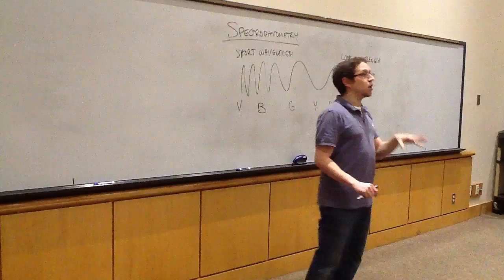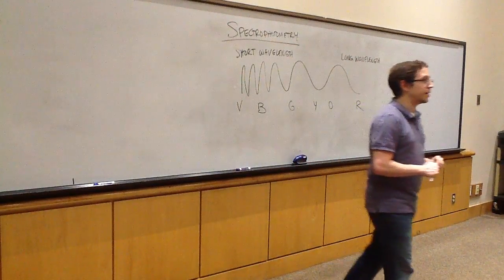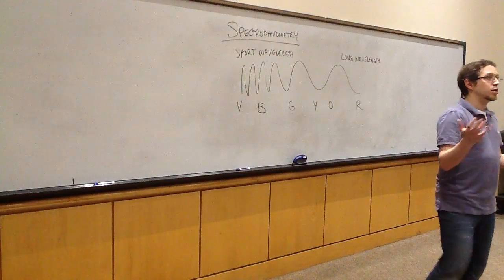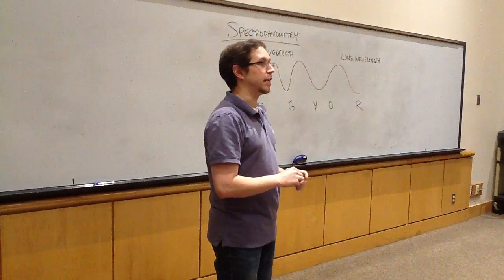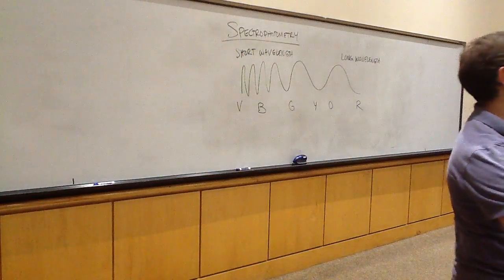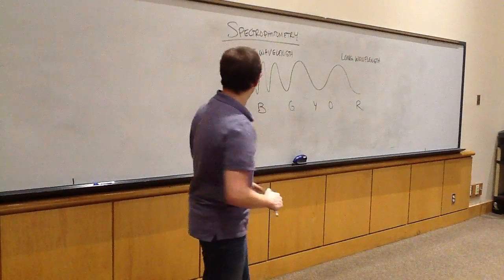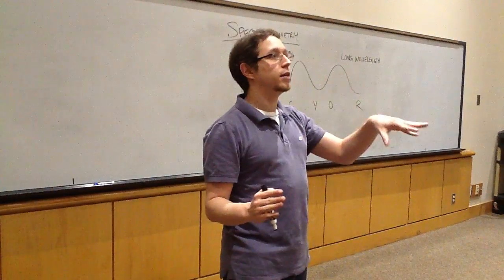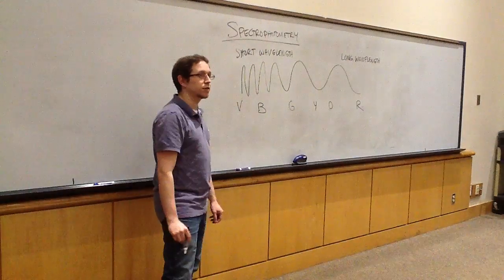So again, study and see what your ranges look like compared to Unit 9's manual, and make sure that you're comfortable with those ranges of wavelengths, because the people who write the practical could ask you anything pertaining to those, based either on what color is this wavelength, or what wavelength would correspond to this color. Okay. Questions, concerns about that? Rather than me just writing it, I'd much rather just let you go look at that table, because I feel that that way you have the information right in front of you and you can see how it correlates to what you guys got. Okay?